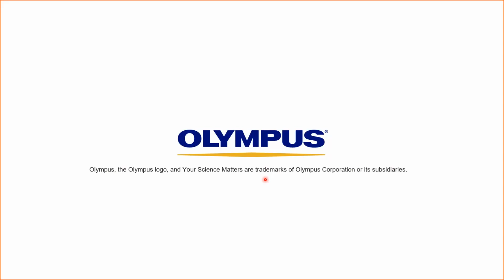You will also need to work that out. That is one of the things you will need to optimize: concentration versus labeling time versus background signal and things like that. That's why we also recommend starting off with smaller slices, especially if you're going to be doing antibody labeling, so that you can work all that out without a huge amount of time or expense with the reagents.